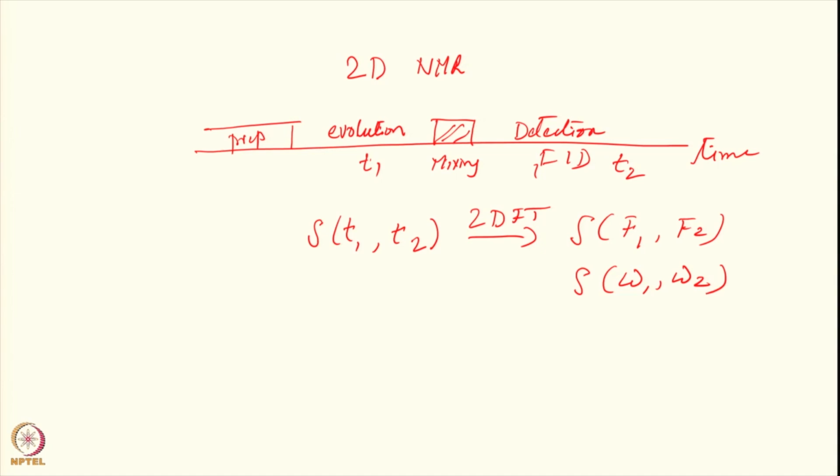So, the concept which you have to be clear about is that this is segmentation of the time axis. The idea can be extended further to multiple dimensions as well. You introduced one evolution time T1, you can introduce other evolution times, 2, 3, 4, 5 etc., and accordingly generate various kinds of evolution times.